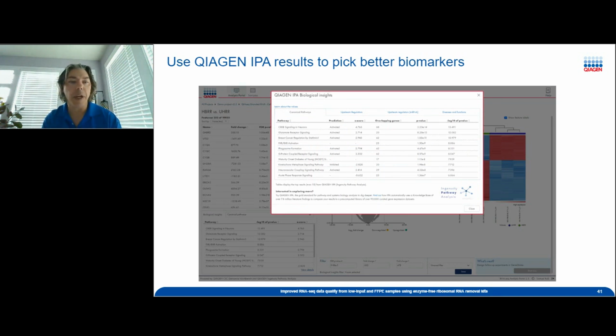And you can see here we have the canonical pathways, upstream regulators that are microRNA, and diseases and functions. It just basically takes your gene expression and compares against the database and says, this looks like a particular type of cancer sample or something else. It's really useful if you're starting with a sample and you really don't know what's going on. It can give you some quick insights into what kind of other things that you might want to look at, or maybe it would say that this sample looks like this other sample here, this particular type of disease. So if you look at that disease, you may see common transcription factors or regulatory networks that are going on here.